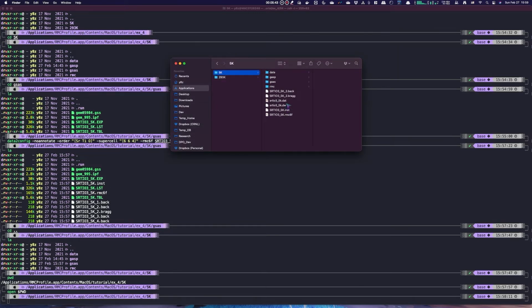Okay, so now we got those files, including both the DAT file, as you have already maybe seen in the first 3 tutorials. This DAT file is just the control file for RMC to do its own job, and a dedicated .dw file representing the distance window configuration, which you can find in the menu. That is something to do with the distance window constraint, basically to specify a minimum and maximum distance for each specific atomic pair in the system.